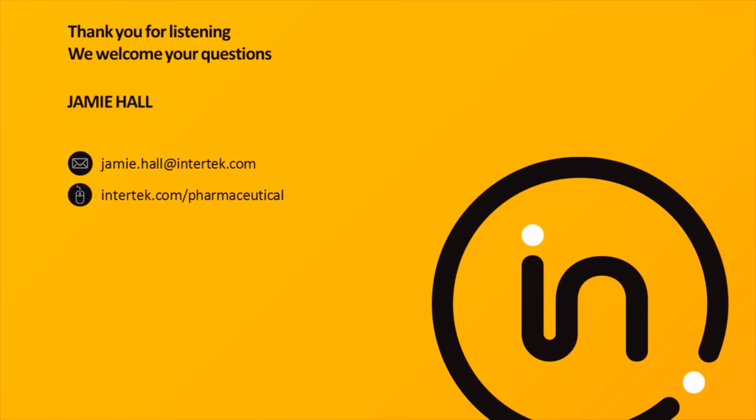At Intertek, we can provide an expedited service. This would typically take less than 3 weeks, but it's important to remember that this is assuming we have a fully developed method in place, again going back to the importance of the method development. This method development phase can take a lot longer, depending on how complex the method is, so starting the development early is really important.